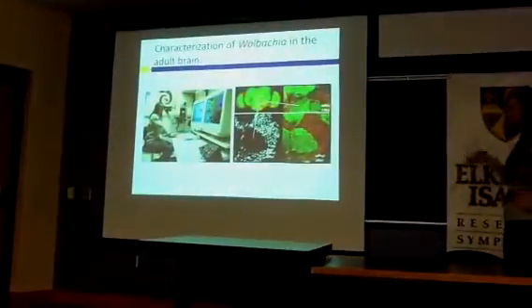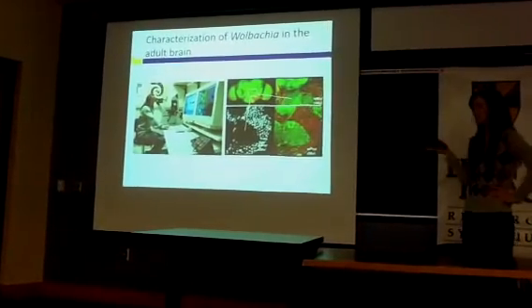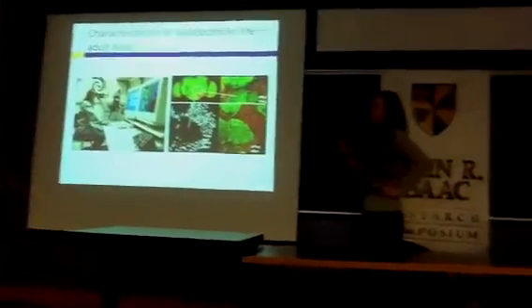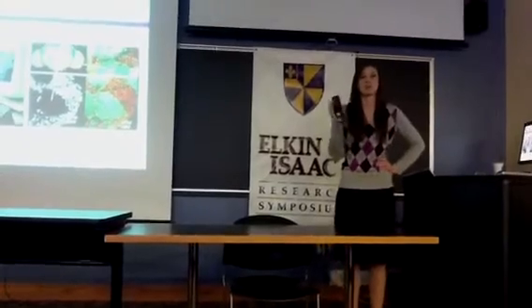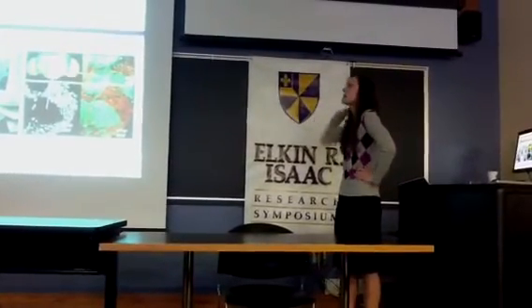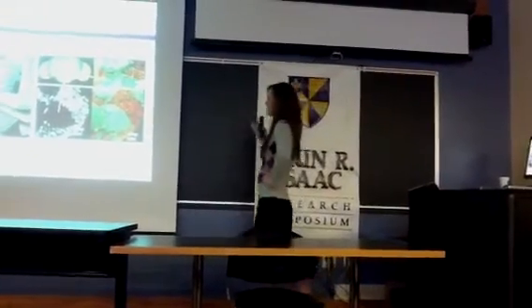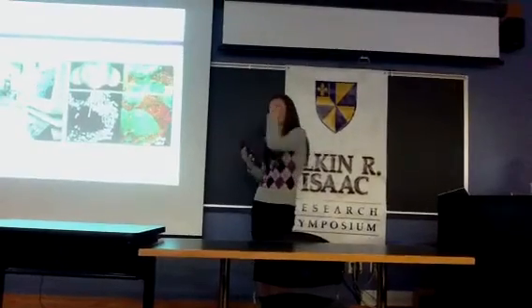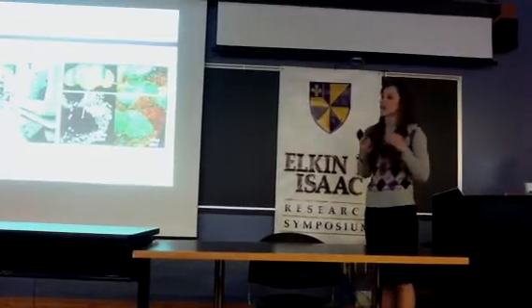Okay, so a lot of my research was actually done at the University of California, Santa Cruz. And I was able to use FIRSCA funding to travel to this lab and to work in their lab for a while. And basically, each experiment that I performed had the same basic principle. And the main goal was to visualize the Wolbachia DNA within the host brain. So in order to visualize these brains, first I had to dissect a lot of adult Drosophila brains, which is pretty tedious work. And then I stained them with antibodies.